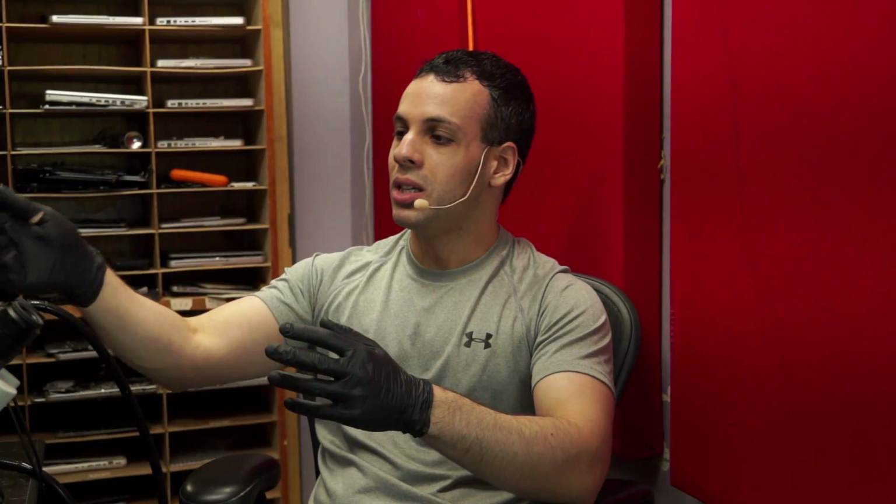You need to be able to see what somebody is doing, and it's not going to work if you're looking over their shoulder like that. If you want to train somebody else or you want to analyze what they're doing, having the camera hooked up to a screen that's above the microscope is very, very useful. You're going to find that there are people that you can train, people that already know everything, and people that you can spend all the time in the world with, and they're meant to do something else with their life. But the point is that it's useful to have the camera so that you can actually see.